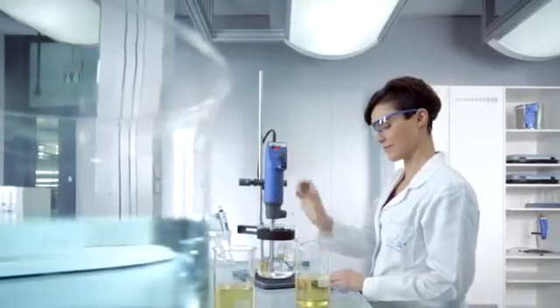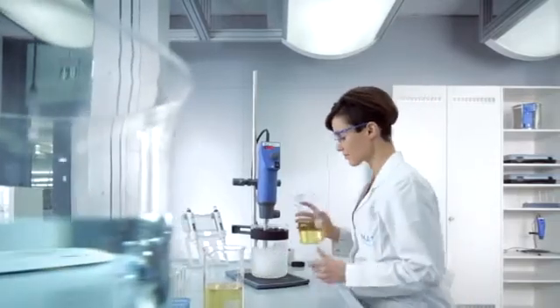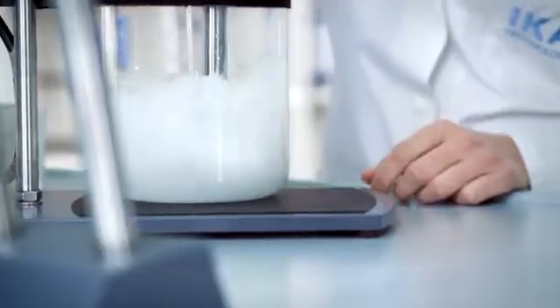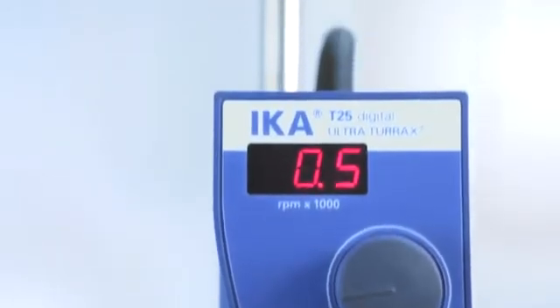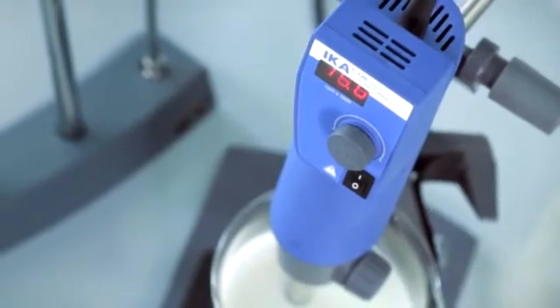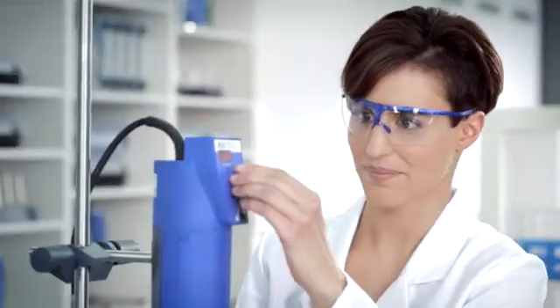The T25 digital: the must-have unit for your applications. The perfect solution for homogenization and emulsification. Extremely powerful and efficient. Stronger than ever. Homogenous uniform particle size distribution guaranteed.